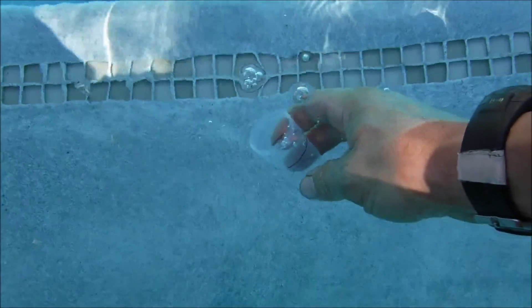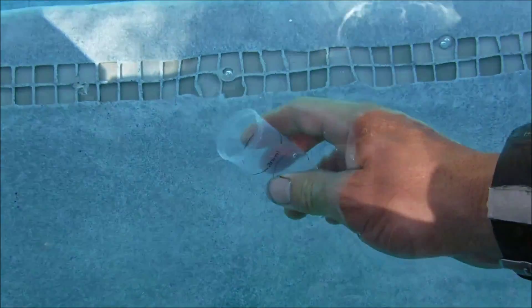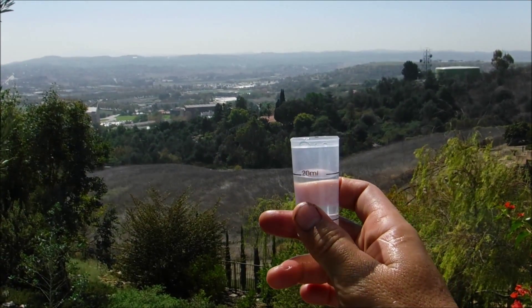We're going to get a water sample about one and a half to two inches down into the water. We're going to fill it to the 20 ml mark on the sample bottle — so you want your water sample at the 20 ml mark.